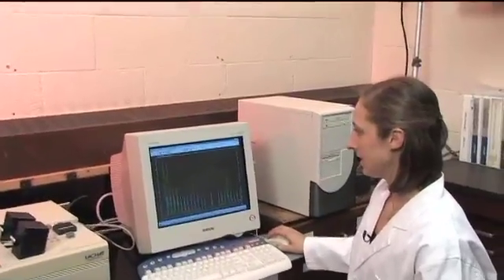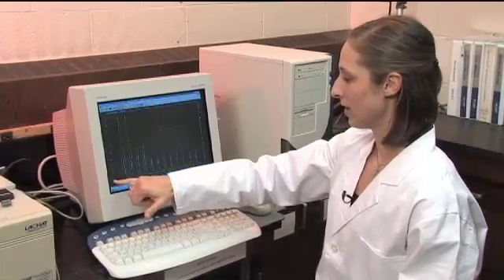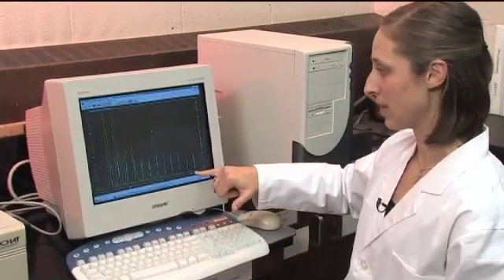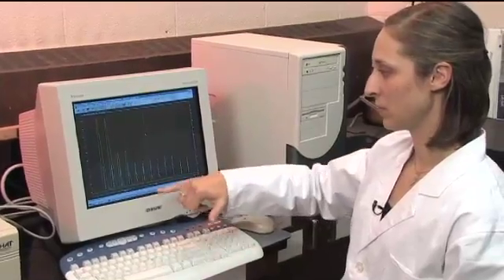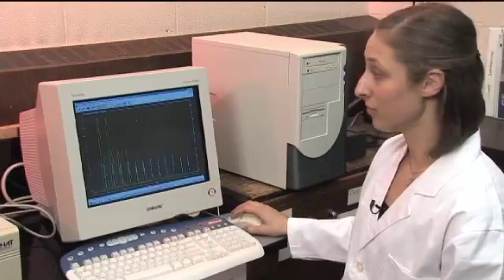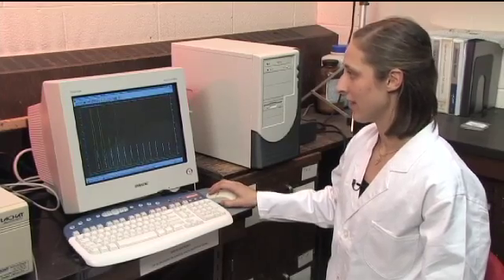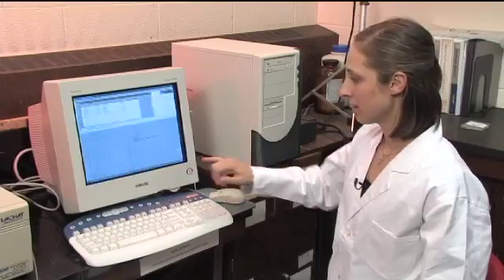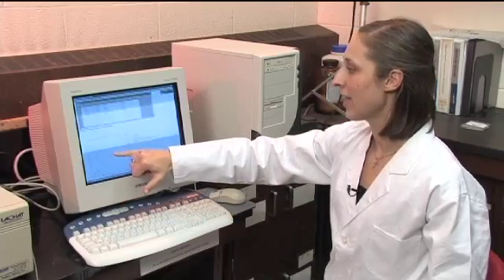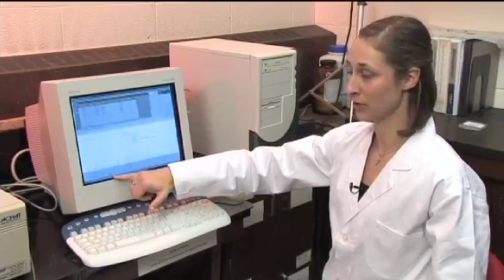Here we can see the peaks that have come out from all of the standards — from the 20 parts per million standard down to the blank, which has no peak. That establishes our relationship between the size of the peak, or the absorption, and the concentration of the phosphate. We can look at the standard curve to see the relationship that was established, which tells us that if we have a particular peak area, we can determine the corresponding phosphorus concentration — for example, 10 ppm.